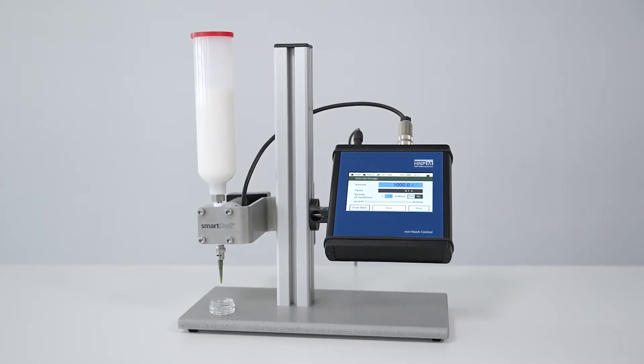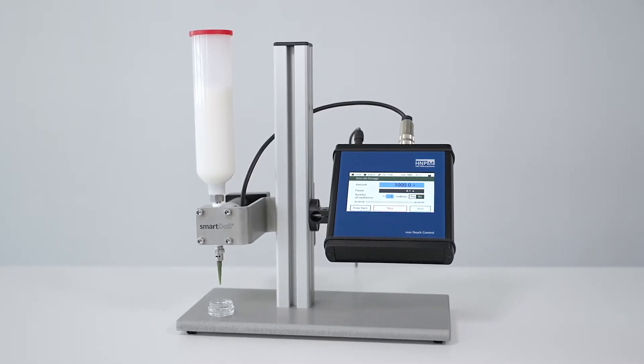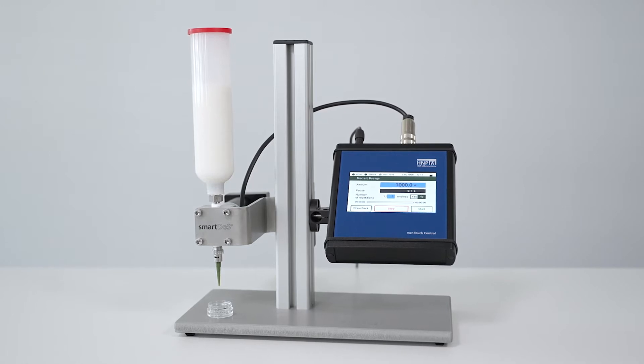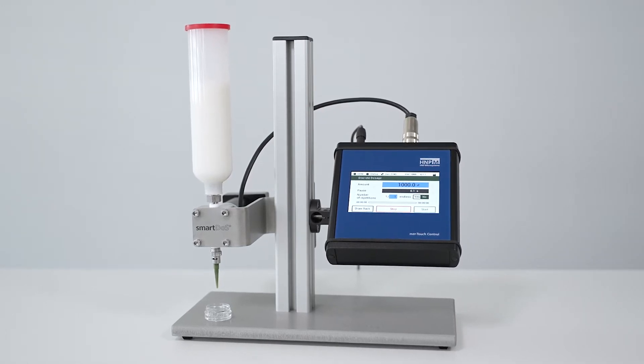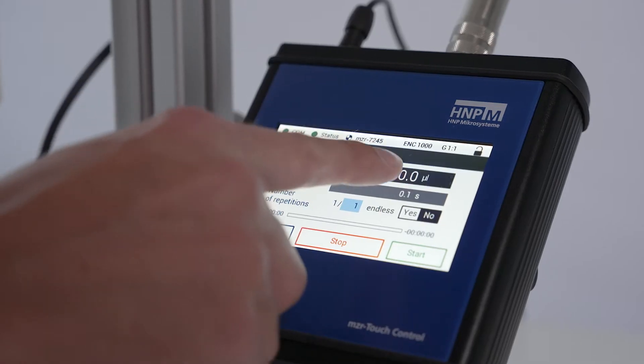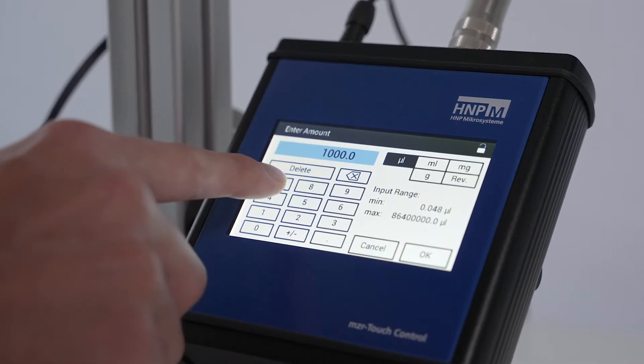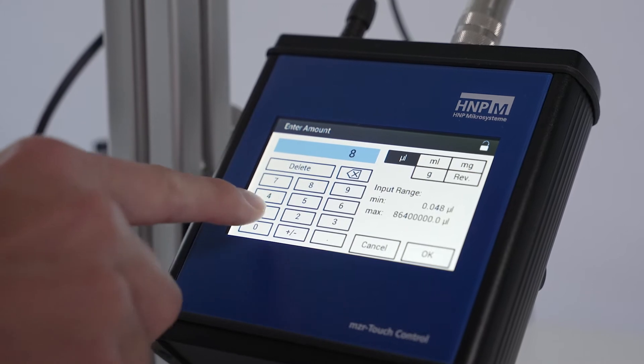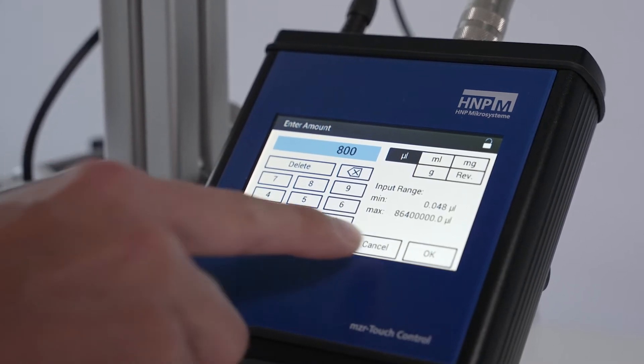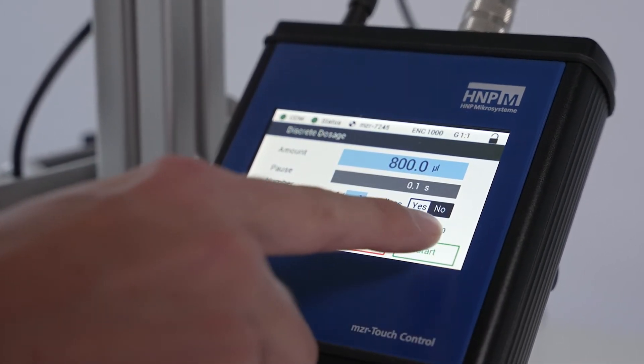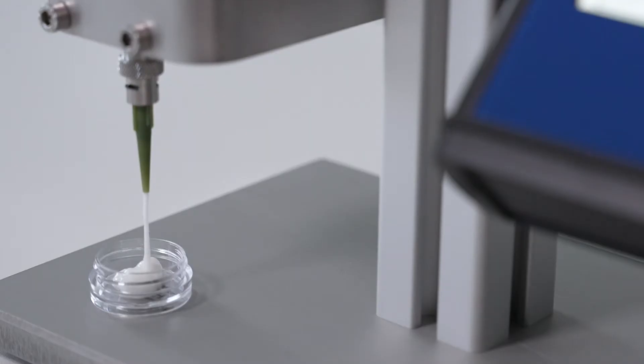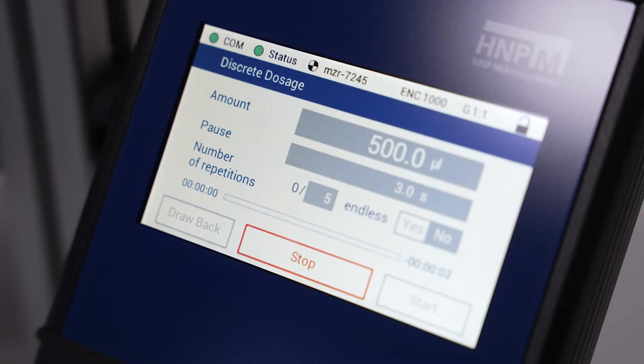Here you see the flexible dosing and filling system SmartDose from HNPM. SmartDose dispenses low and high viscous liquids. The dispensing quantities in the micro and milliliter range are entered directly via the control system.